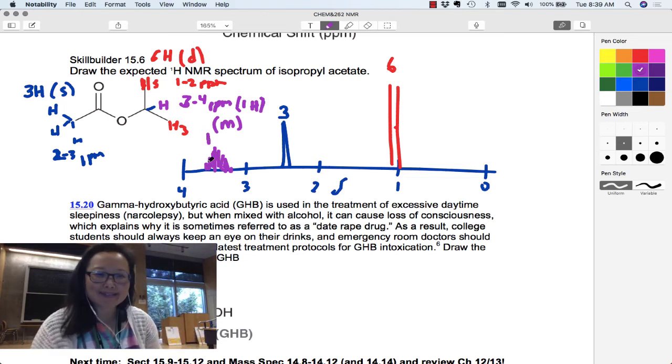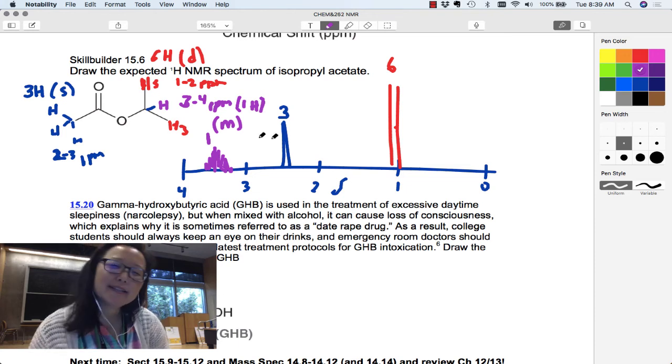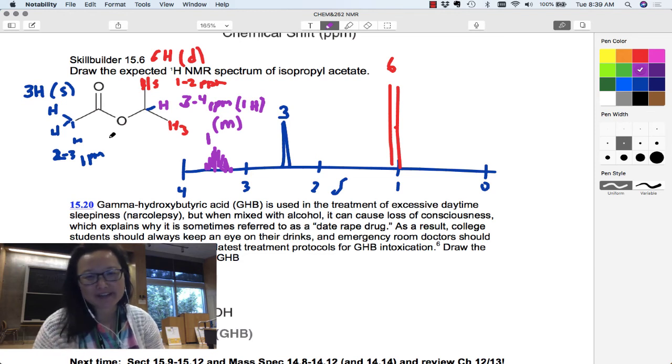And you're going to just say this is a 1H integration. And clearly, it's a mess. So M for mess or M for multiplet. All right, so that helps you because it forces you to put all the information together. So do a few like that just to get used to thinking about all those things.